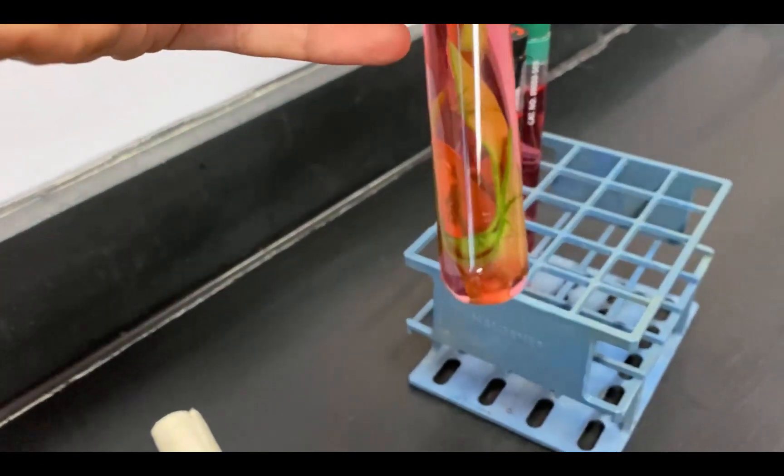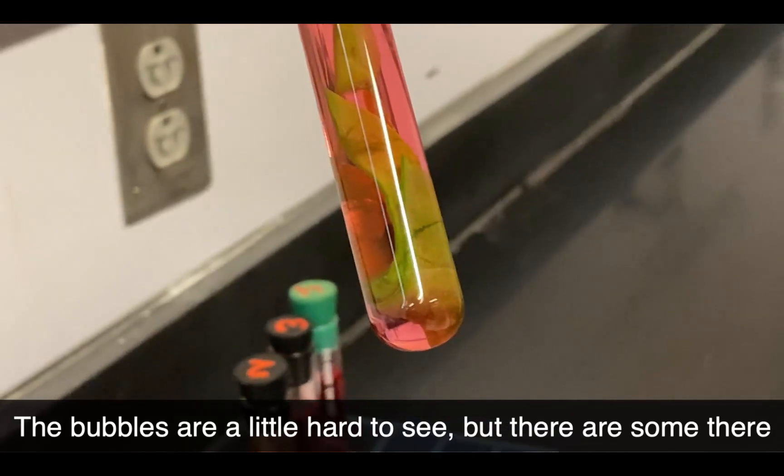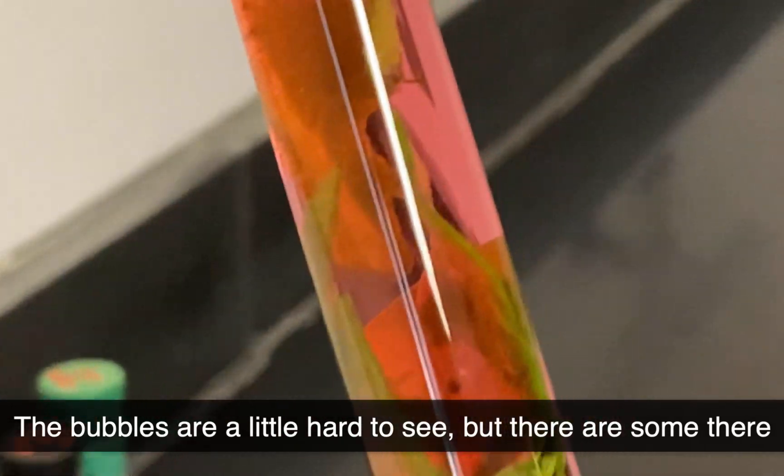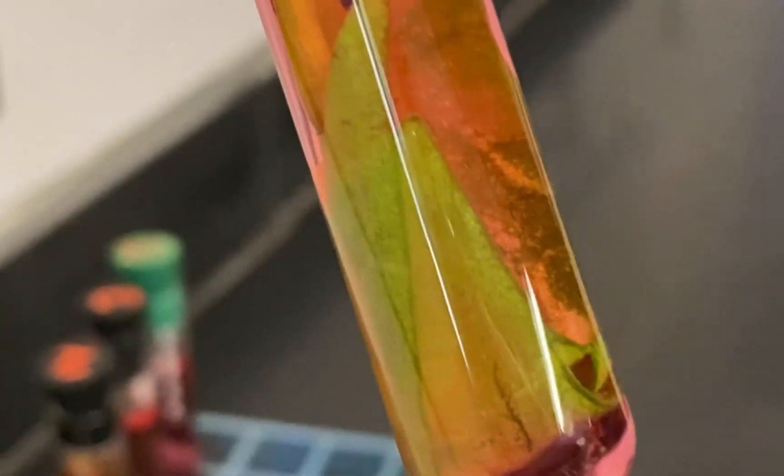The only thing we have left is to take a close look at tube number one and see if we can find any bubbles forming. We can see some on the underside of some of those leaves. If we see bubbles, we want to ask ourselves where would those bubbles come from? Which part of our process could potentially produce new gases as these leaves undergo photosynthesis?